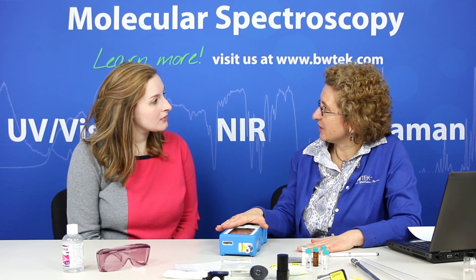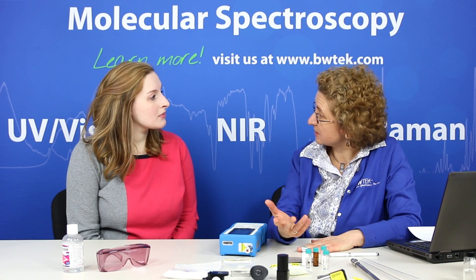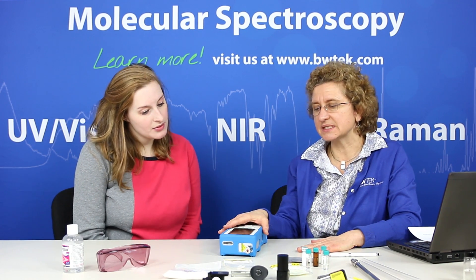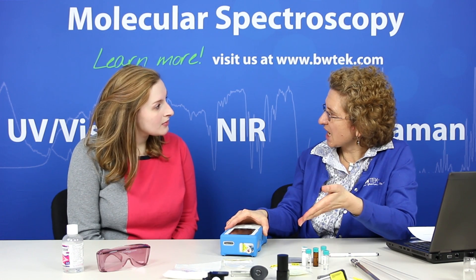Raman is used quite a bit in many different areas, but with the handheld it's designed for the pharmaceutical industry so that we can measure the incoming raw materials, which are required in the industry to measure. We can use this small format instrument in the loading dock, in the receiving area, or the dispensary. We can use it in the laboratory or wherever you need to take your measurements.